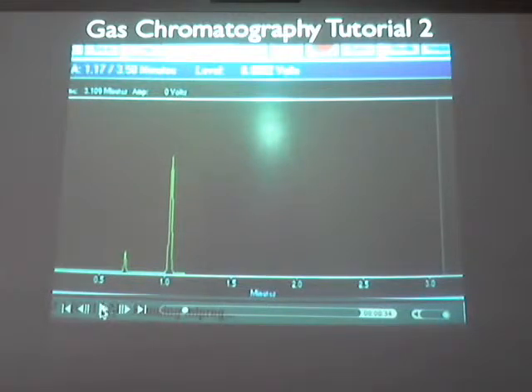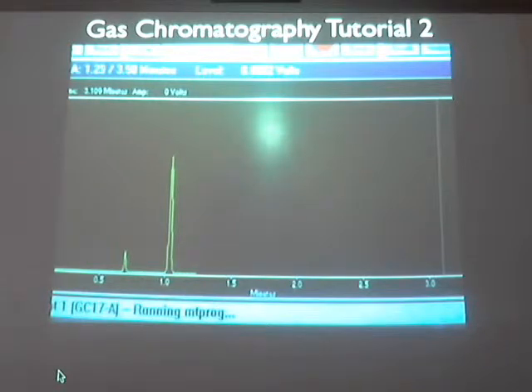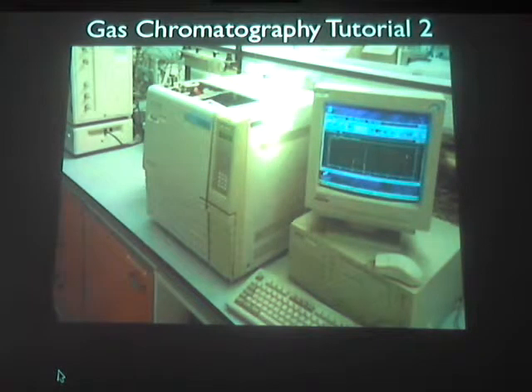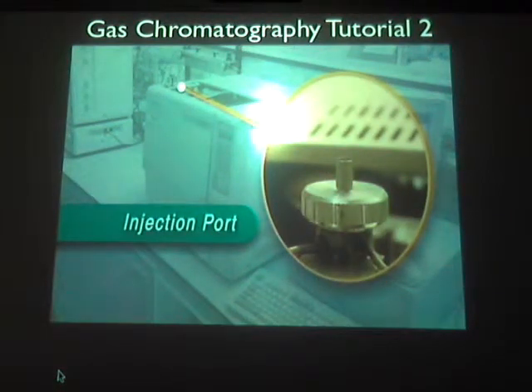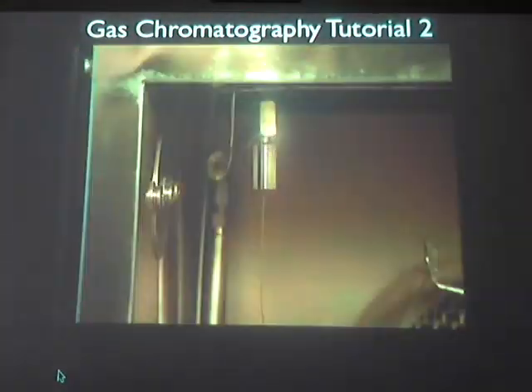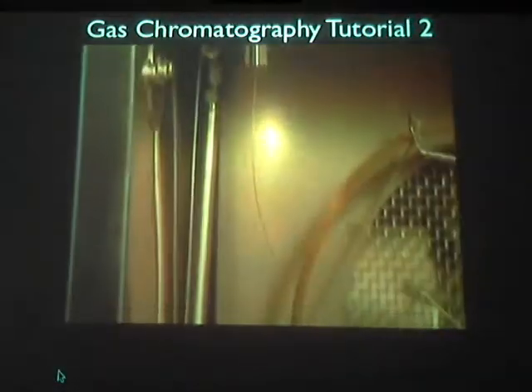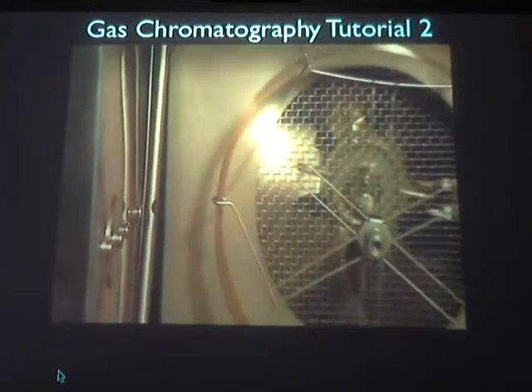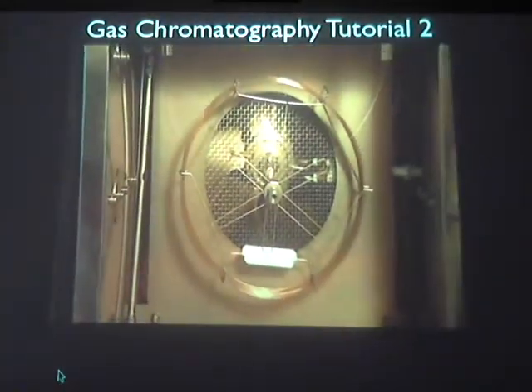Okay. All right. With solid or coated with a high boiling point liquid. The components of the mixture leave the column in order of volatility, the most volatile first. This is the complete instrument, with the computer control system on the right. The sample is injected here. From this injection port, the sample passes into the column, which is kept in a temperature-controlled oven. See the column? That's that coil. Columns are normally wound into a spiral to save space. This capillary column is 30 meters long.